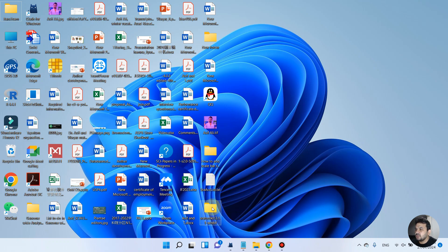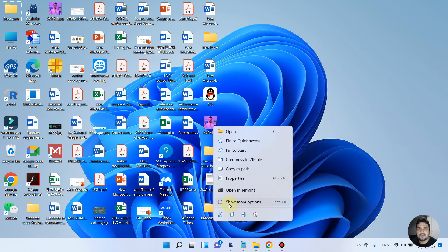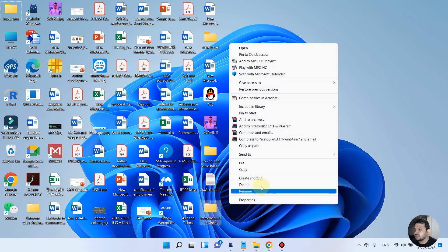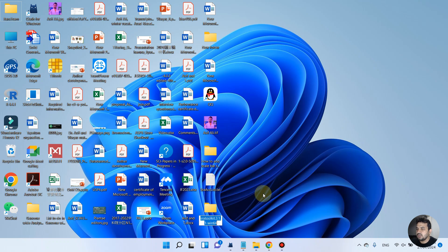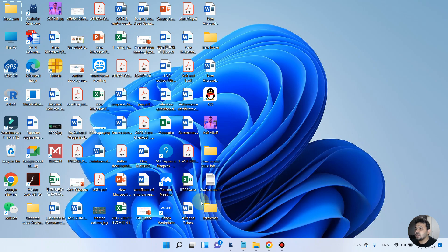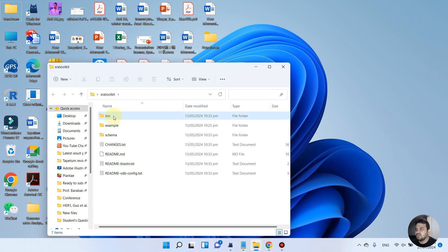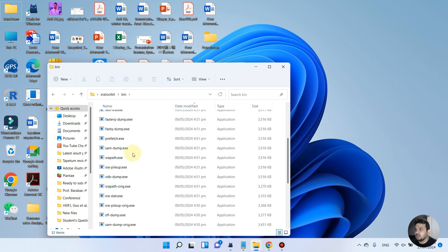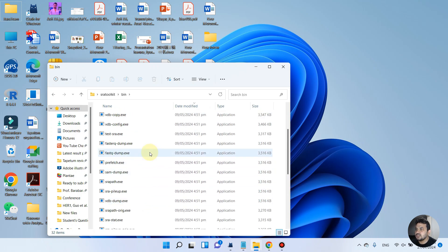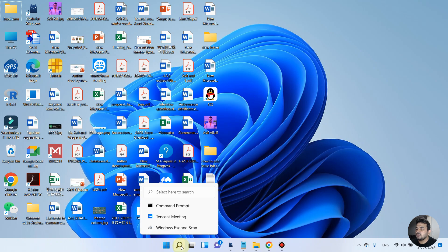Now we have SRA Toolkit on our desktop. Let me rename it for simplicity, because we will be using its name several times. I will just call it 'sra_toolkit'. Inside the SRA Toolkit folder we don't need to do anything — we will just use the command prompt to access the bin folder.